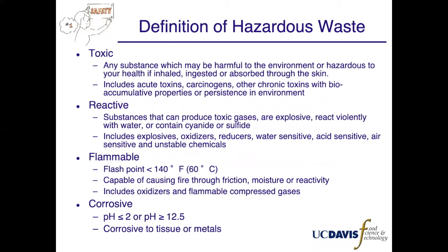Reactive substances are substances that can produce toxic gases, are explosive, react violently with water, or contain cyanide or sulfide. This includes explosives, oxidizers, reducers, water-sensitive, acid-sensitive, air-sensitive, and unstable chemicals.